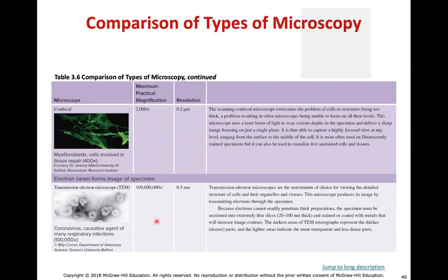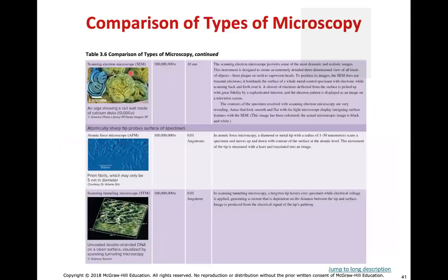And essentially what they're using now is a beam of electrons instead of light, okay? And if the electrons get blocked, there's a filter on the other side, and if the electrons are being blocked from passing through because of the object, that would be reflected on the other side. Here's another electron microscopy image, and you can really see some nice fine details of the cells here.